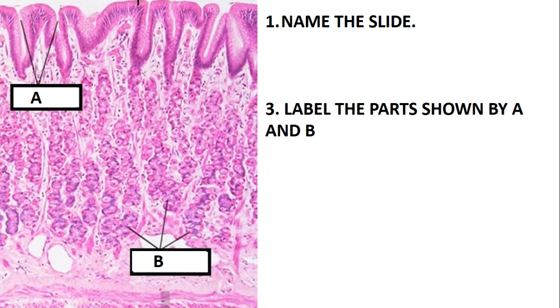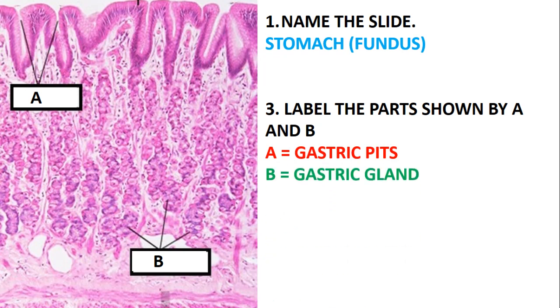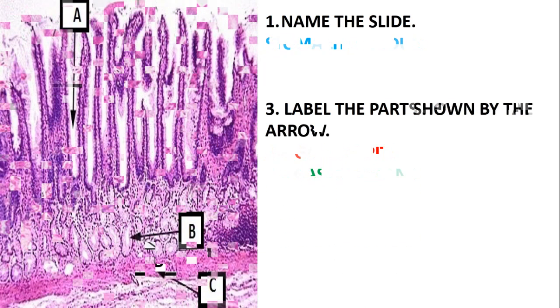Moving on, name this slide. This slide is still the stomach — A is just showing the gastric pit and B is just showing the gastric gland. So the answer is just the stomach, specifically the fundic part. Label the parts: A is the gastric pit and B is the gastric glands.